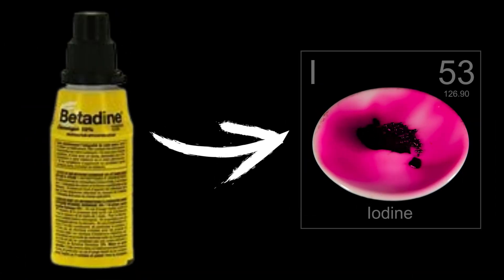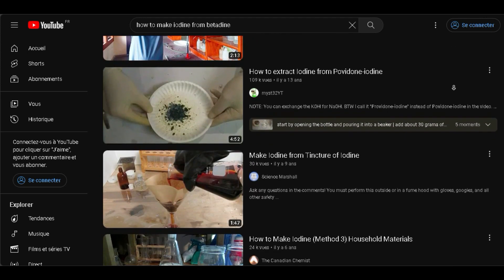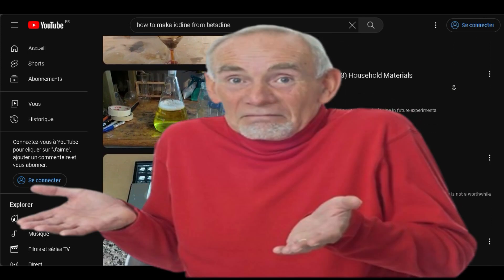Hello back everyone, today we're making elemental iodine from betadine. I know this is a classic video, but I wanted iodine anyway, so why not make a video as well.